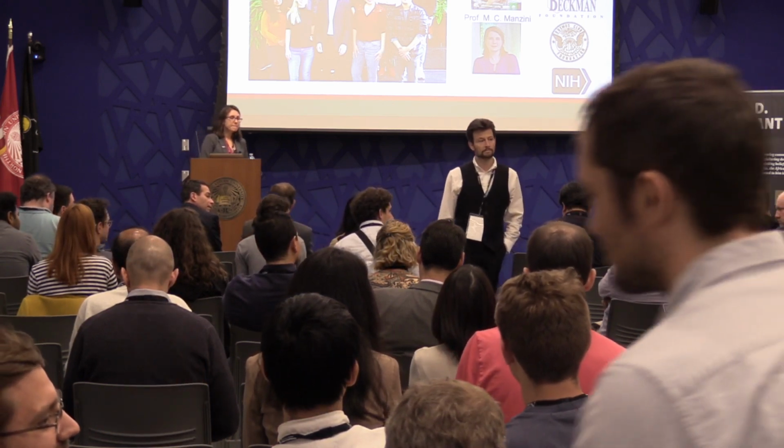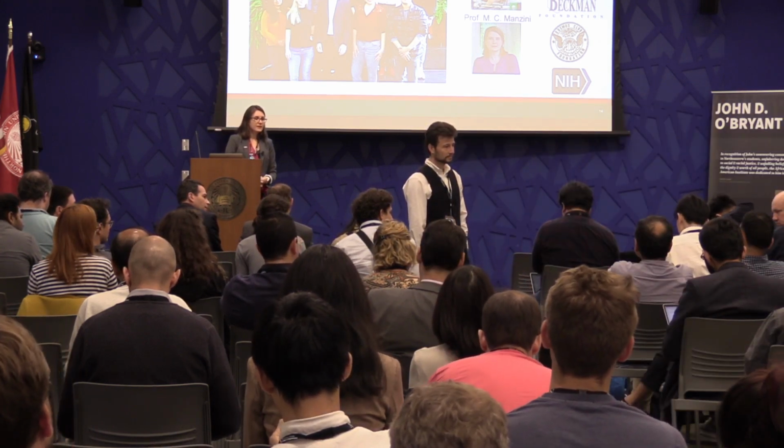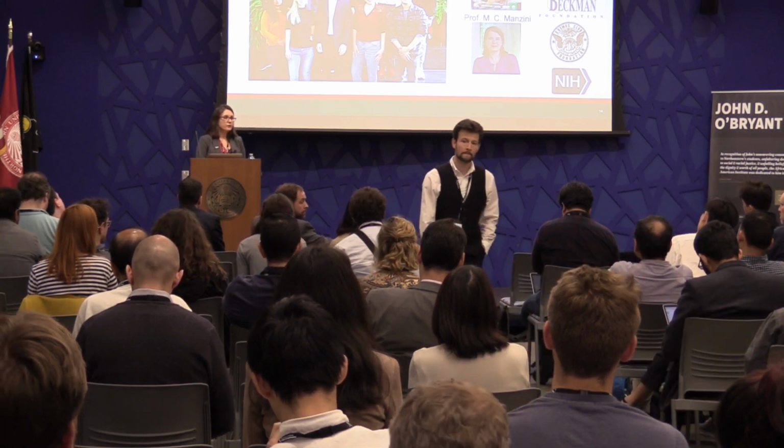Yes, great talk. Thank you. So I have two questions. The first is, I guess you're not able to identify any of the membrane proteins, right? So we identified a few membrane proteins, but that being said, we did not identify more membrane proteins using whole cell dissection than using the microprobe. So in that way, we did not bias compared to dissection.